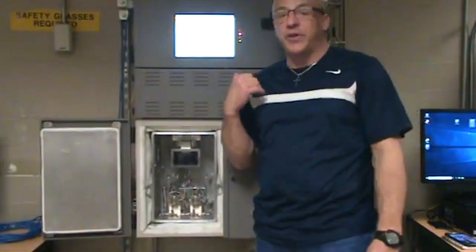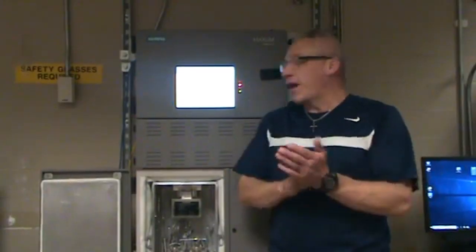Right now we have our analyzer slowly but surely warming up right next to us here. We are going to discuss the software of GCP, GC Portal. All right, so to begin with, the analyzer I just kicked on, we have to have carrier gas and air to it. We have both of those going. Ta-da! Maxum 2. Okay, everybody, let me introduce you to the Maxum 2.